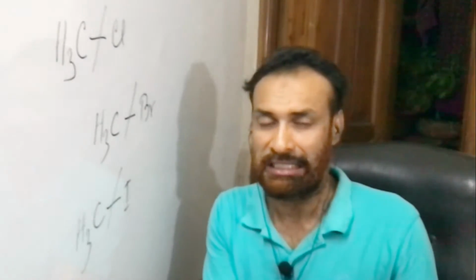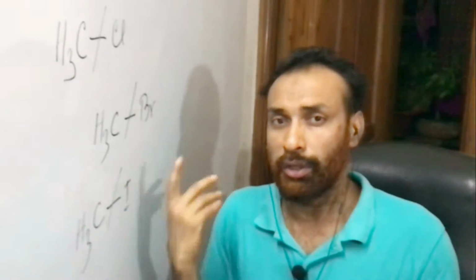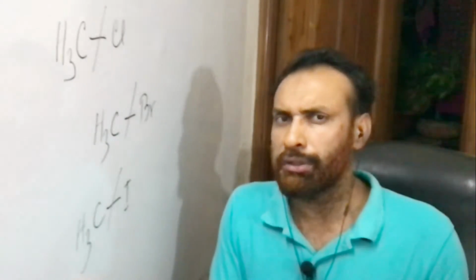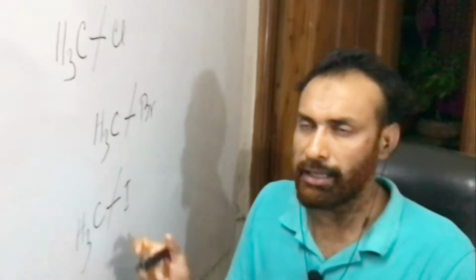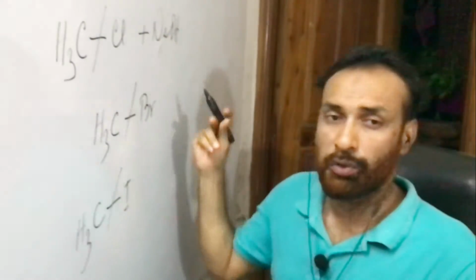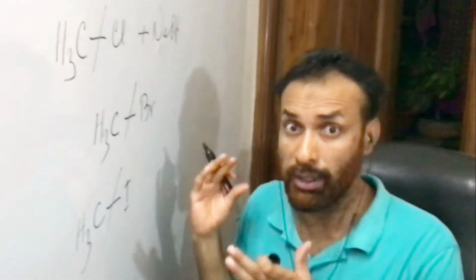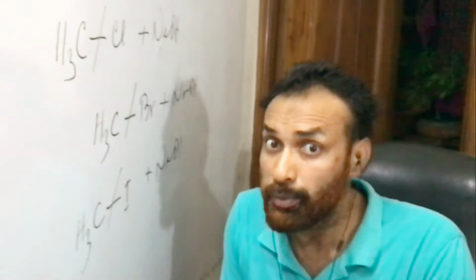This is the addition when you go for testing halogens in organic substances. How should we do this? Very simple. You take them in a test tube and heat with sodium hydroxide. This could also be possible with water, but sodium hydroxide is better, that is faster. Then what happens?